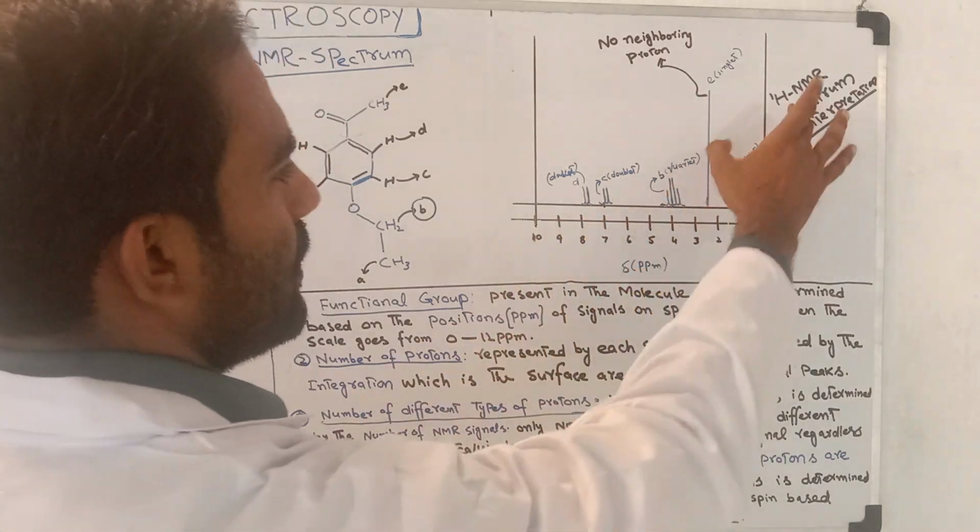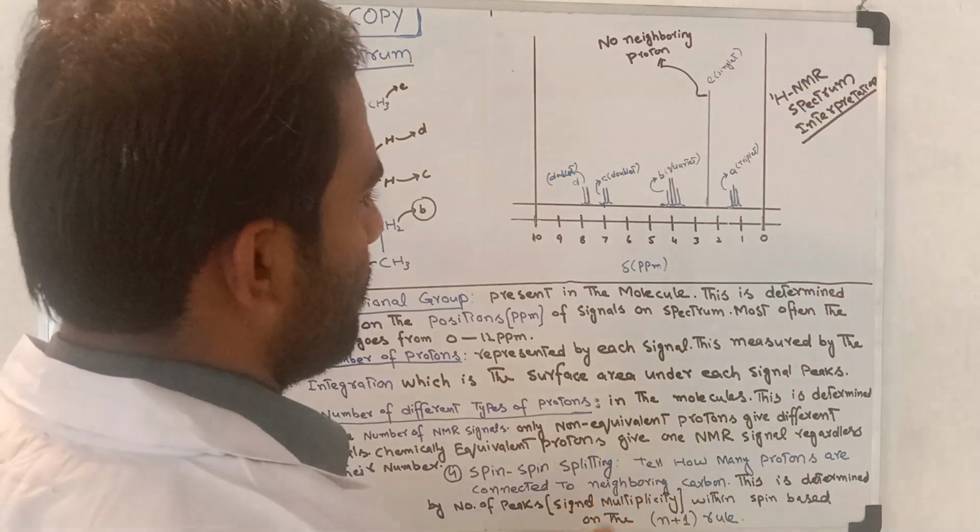Now let's move to the hydrogen NMR spectrum interpretation.